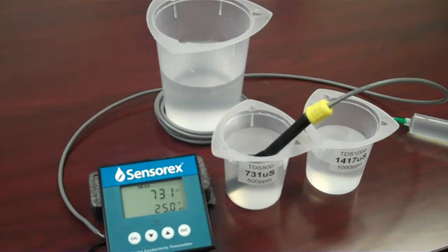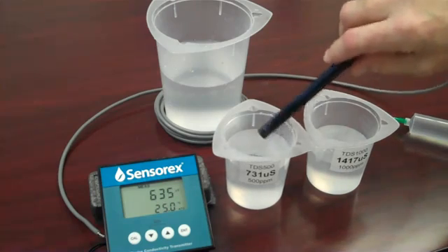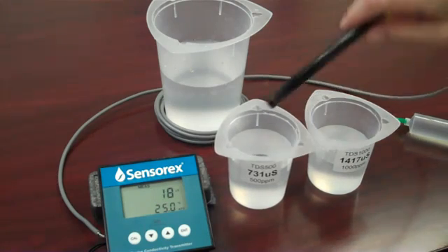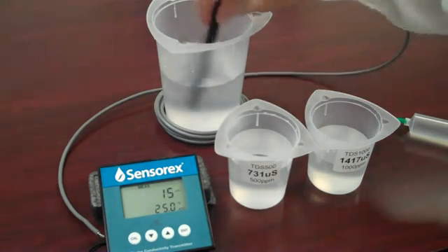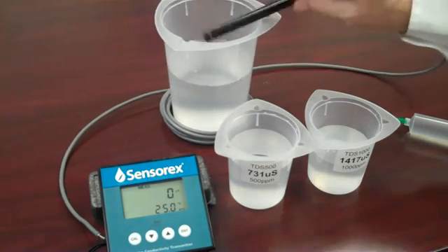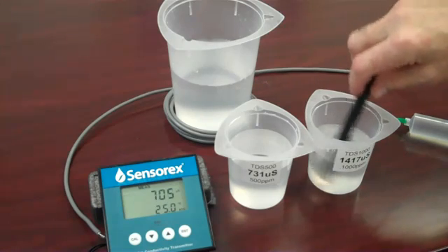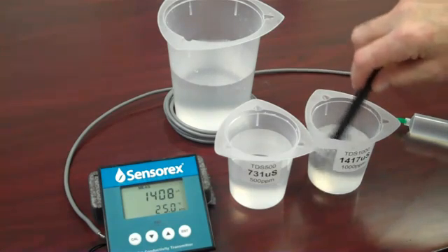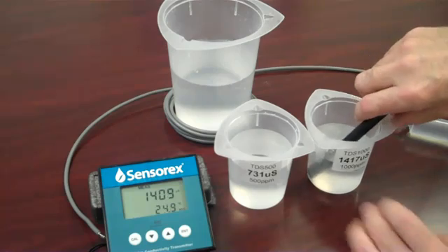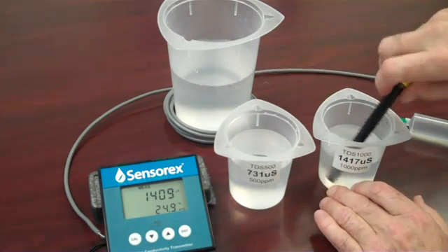It's a good idea to check your calibration using a second conductivity standard. In today's example, I've selected a second standard that has a conductivity of about twice my calibration standard. I'll be going from 731 microsiemens into a standard that has a conductivity of 1,417 microsiemens. The 1,417 microsiemen solution has a total dissolved solids of 1,000 parts per million.